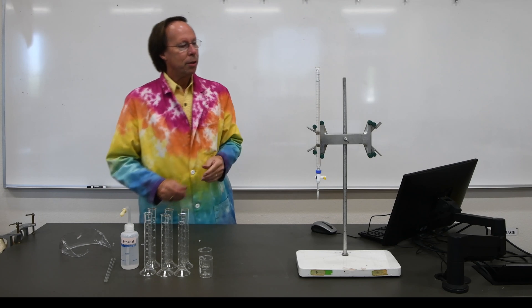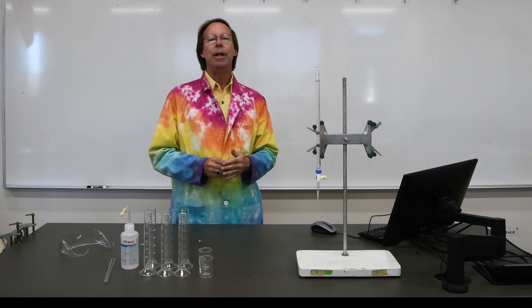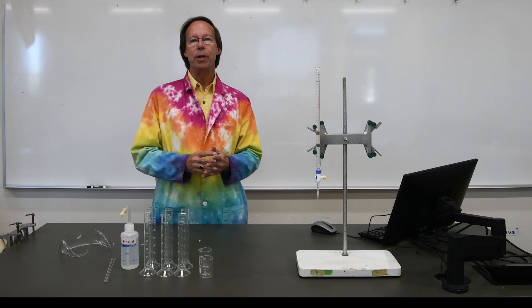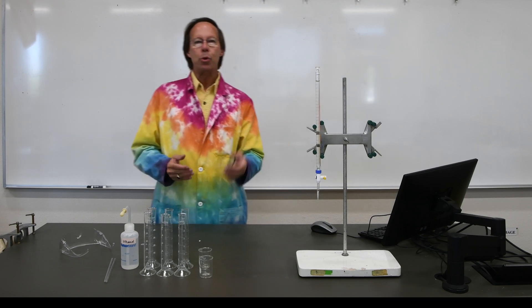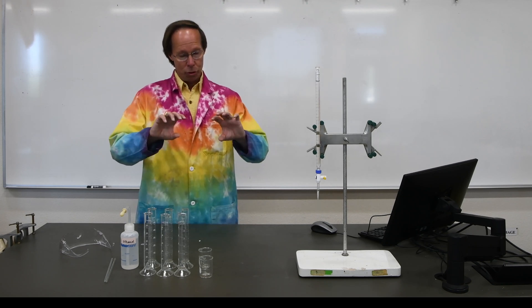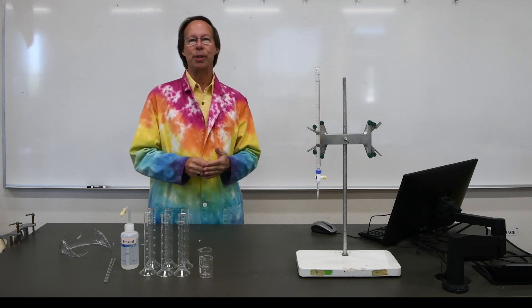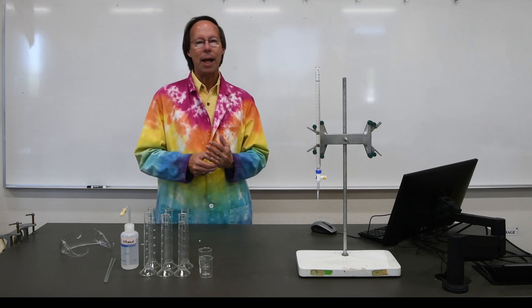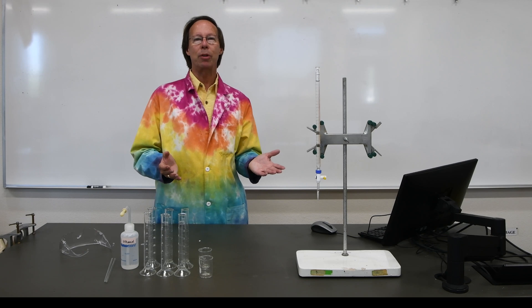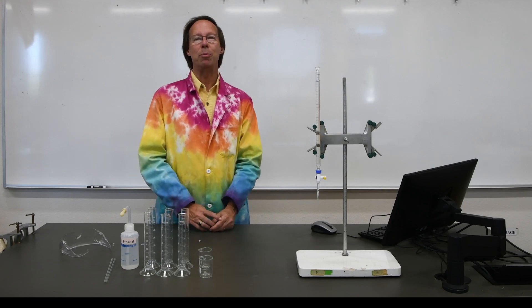We'll be measuring volumes of liquids in each of these three, and then we'll determine how accurate each one actually is. The other part of the experiment has to do with combining liquids. You might think if you took 20 milliliters of water and 20 milliliters of alcohol and mixed them together, you would get a volume of 40 milliliters. But that's not necessarily the case. We're going to compare what happens when you mix two identical liquids together, and then two different liquids — and you'll find that the volumes aren't always what you would expect.